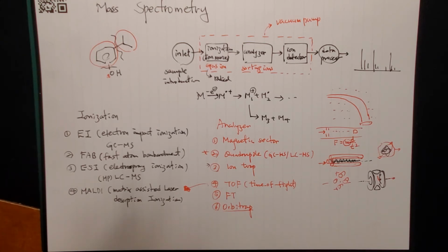Not only giving the molecular weight, but you can find out some aspects of the structures, and the ratio of the isotopes, and being able to analyze a big sample like a protein, not only a gas sample with a molecular weight of a couple hundred, but thousands and thousands. Then we can somehow control the fragmentation pattern, and you can do much more things that could have been impossible 10 or 15 years ago.